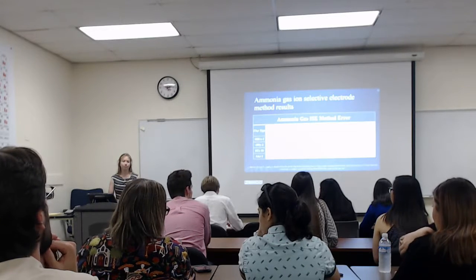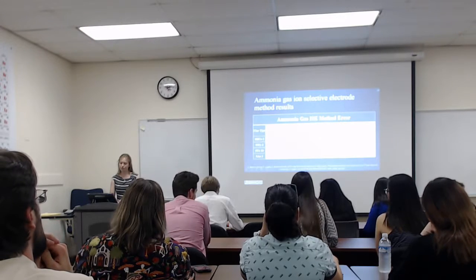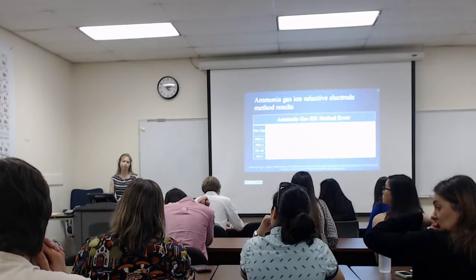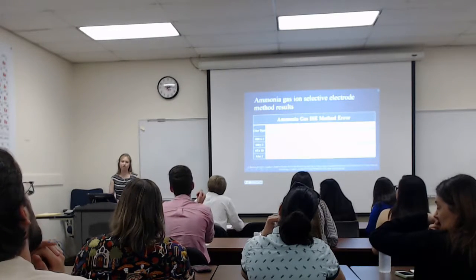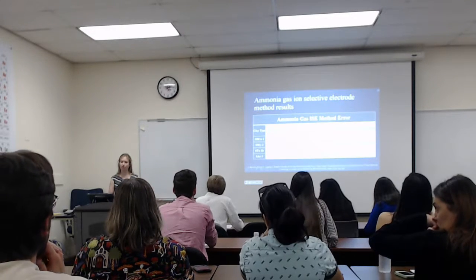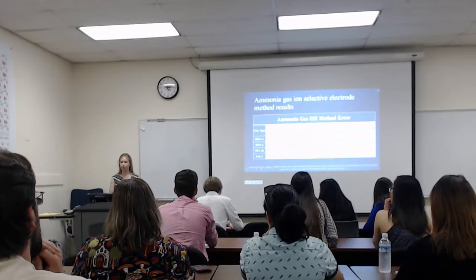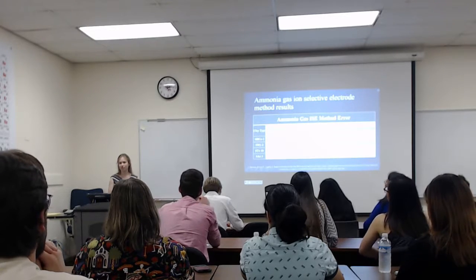Do you think that could have any effect on the general increase of your CEC? Maybe there's some kind of contamination of the electrode. What's the cleaning procedure for the electrode in between samples? You rinse it off with DI water, dry it, and go. So it very well could be that there is some contamination, because these systems are not left closed while they're mixing. We mix them in open air. So there is the possibility flakes from the ceiling could fall into them and change it.